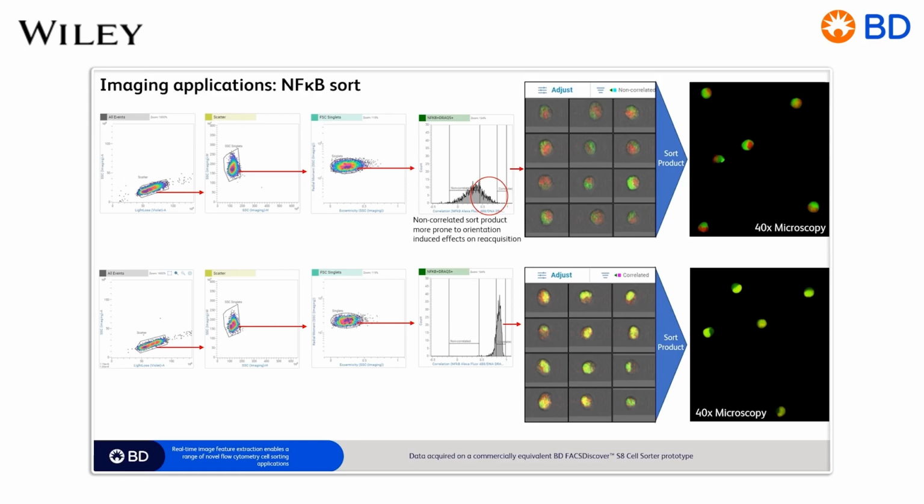Usually, imaging features that measure two fluorescence channels, like delta center of mass and correlation, tend to show this kind of effect, but it's not the biology and it's not an artifact. It's strictly orientation. And I'll show you a number of imaging features where this doesn't happen, because the orientation doesn't matter. A lot like the correlated ones, orientation doesn't matter because the location is the same no matter what angle you look at the cell.